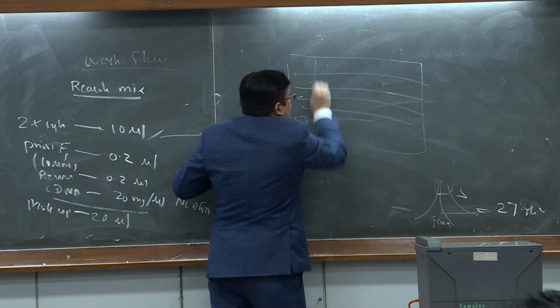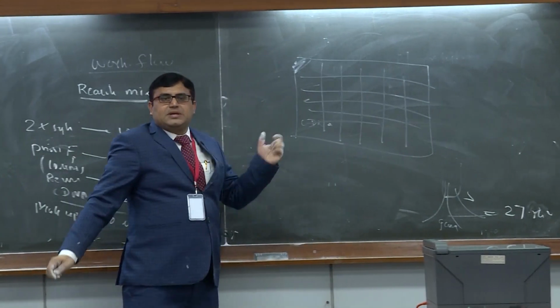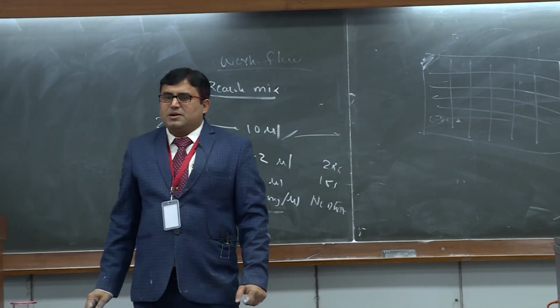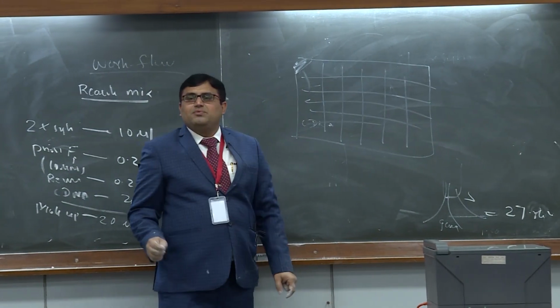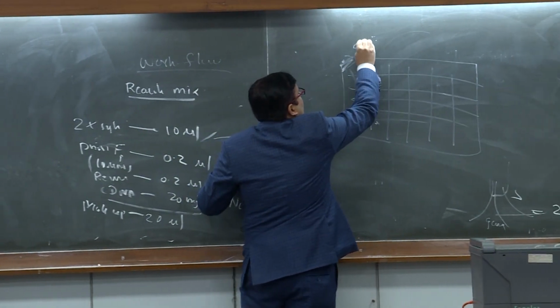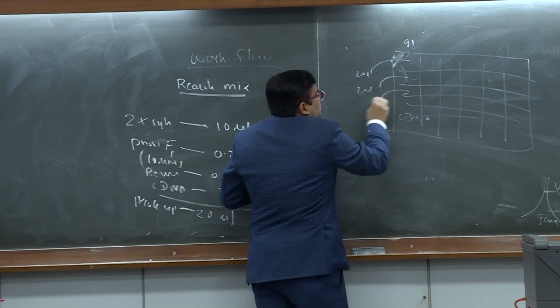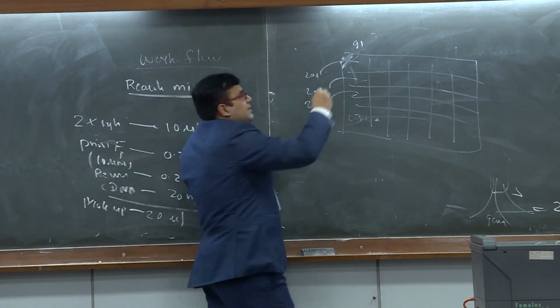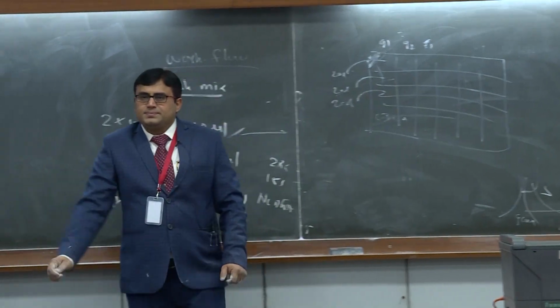I will show you the plate when we go to the lab. So the plate will be something like this, a skirted plate. What you have to do is, in a parallel way you have to load your sample. Like suppose G1, this should be my 20 microliter, 20 microliter, 20 microliter, like this. Then G2, E1, like this you have to load.